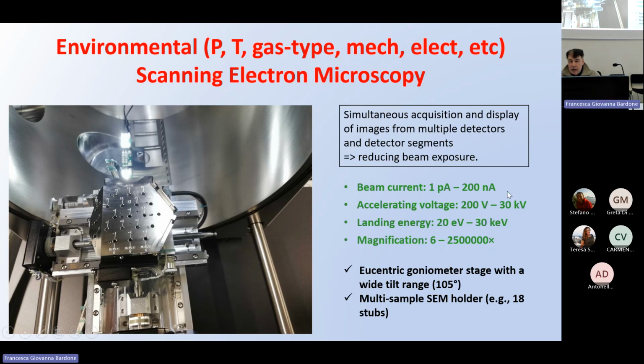So this is the typical working condition: current from picoamperes to 200 nanoamps, with accelerating voltage in the range of kilovolts, but down to some volts.